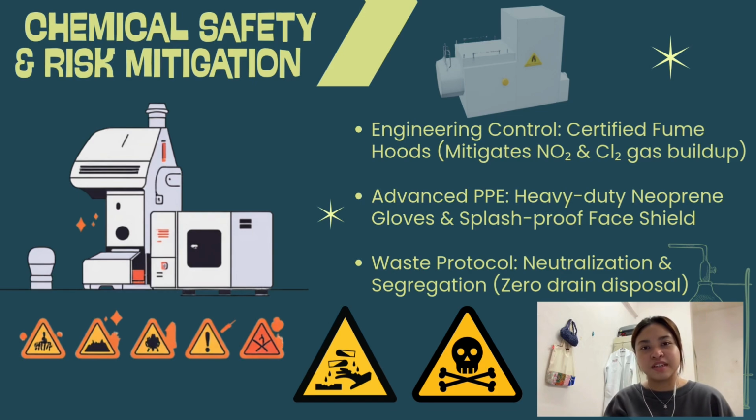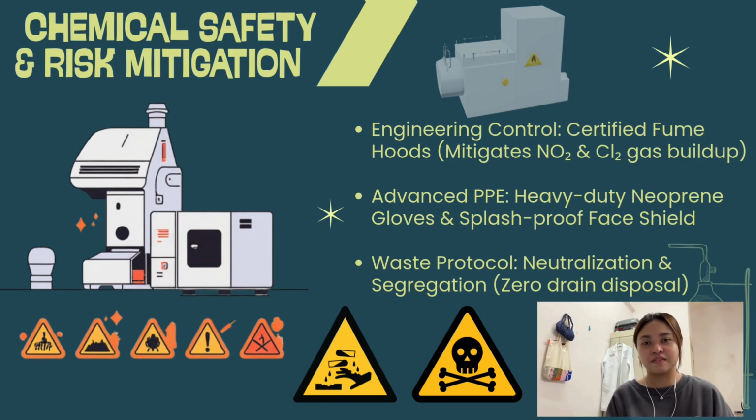As we just saw in the methodology, these heavy-duty cleaning formulations are exceptionally powerful. However, with great chemical strength comes severe operational risk. Because this presentation focuses heavily on chemical safety within analytical applications, we must address the non-negotiable risk mitigation protocols required when dealing with these solutions. First, let's talk about engineering controls.